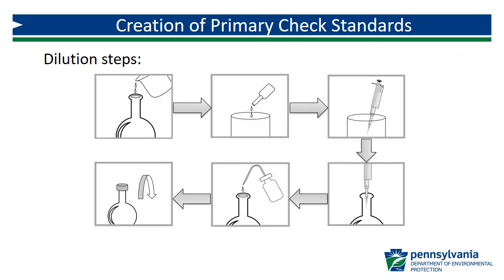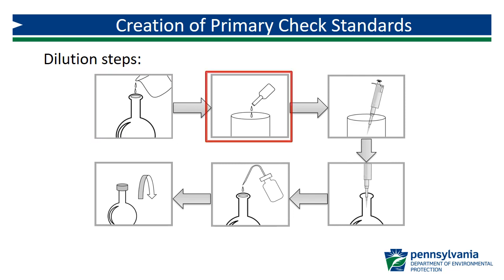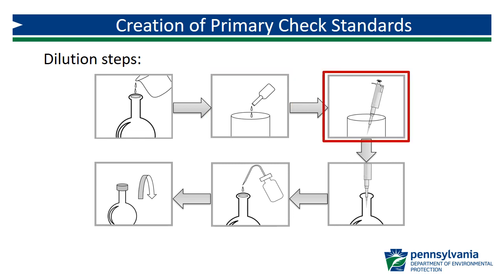Now let's review the steps in a dilution of primary standard. Add about half the volume of reagent grade water to the volumetric flask — for example, about 50 milliliters if the final volume will be 100 milliliters. Break open the certified primary standard ampule and pour into a chlorine demand-free container such as a specimen cup or beaker. Adjust the pipette to the desired volume V1 from your calculation, and use the pipette to draw the V1 volume from the specimen cup. On many adjustable pipettes, the first stop of the button or plunger is for drawing solution into the tip.